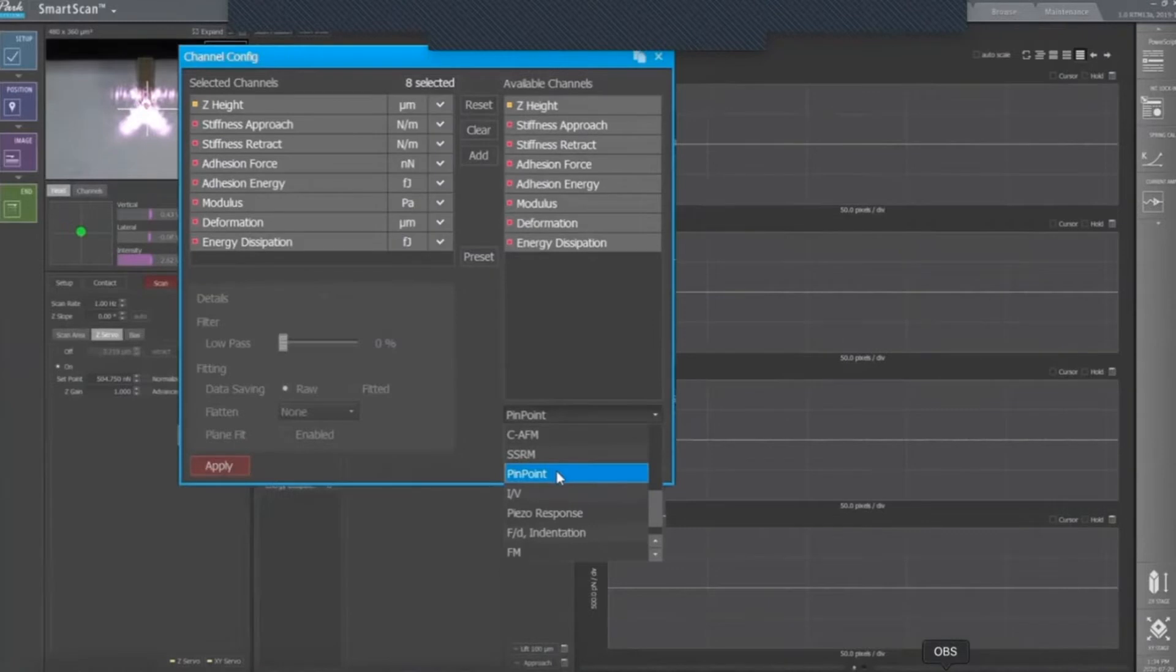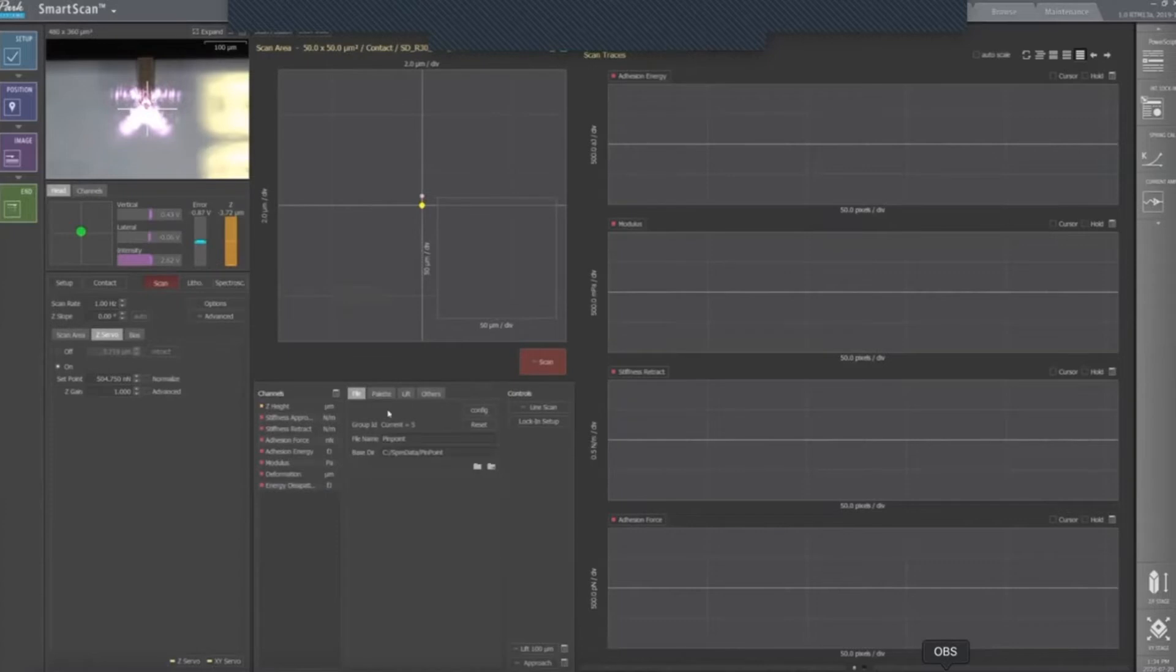After selecting the cantilever, you have to activate the PinPoint channels that will allow you to measure topography and nanomechanical properties, such as deformation, modulus, and adhesion.